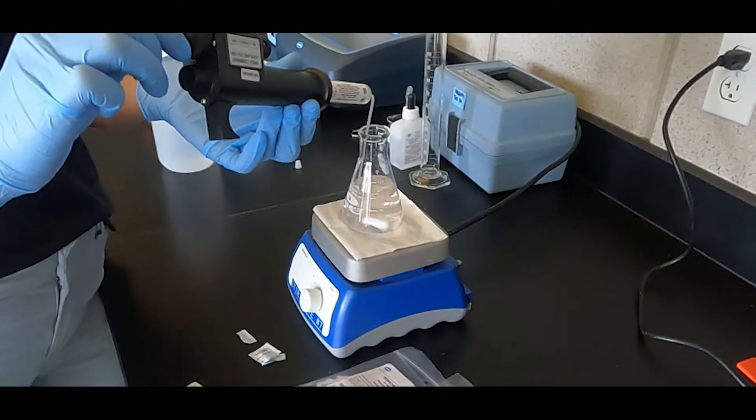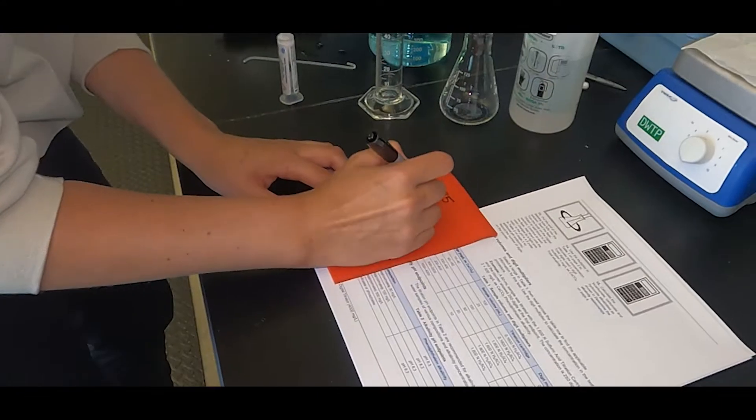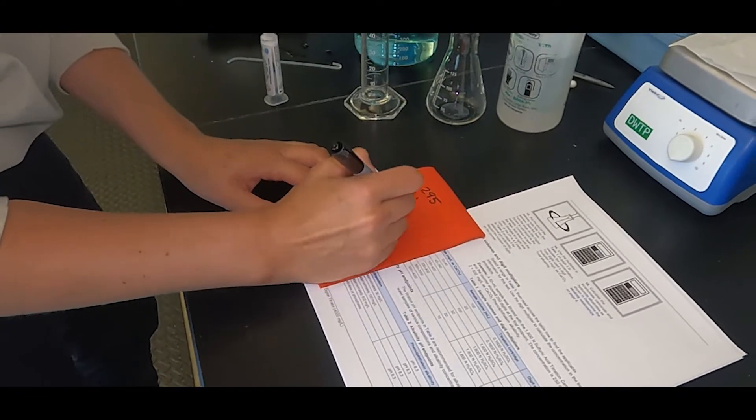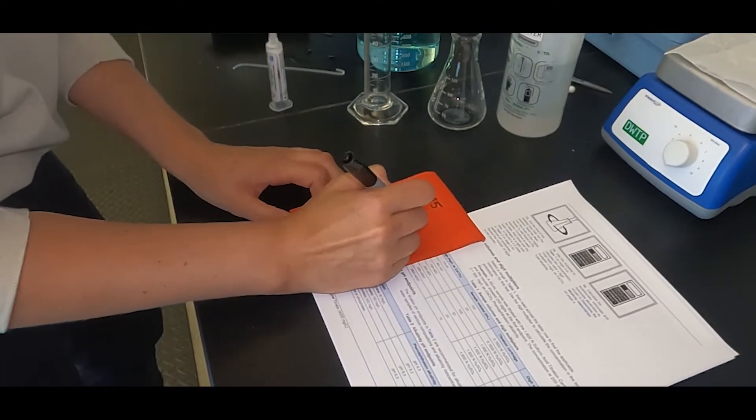Record the value displayed on the digital titrator and use the multiplier in the table to calculate the concentration as milligrams per liter of calcium carbonate.